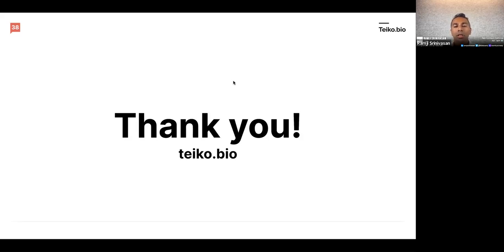Okay, next question is, were the PBMCs created in-house or from a lab? And the answer is a mix of both. The healthy donors were sent to us from an external facility, and then we turned them into PBMCs at our lab.